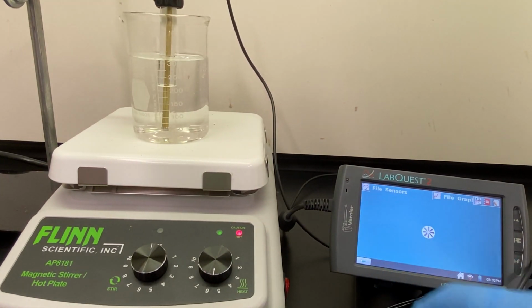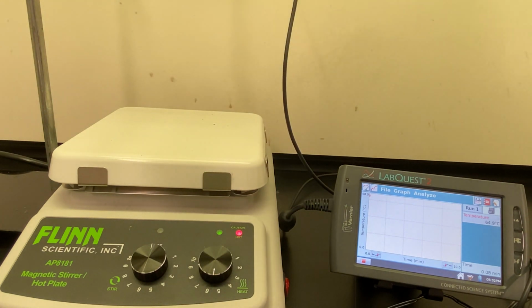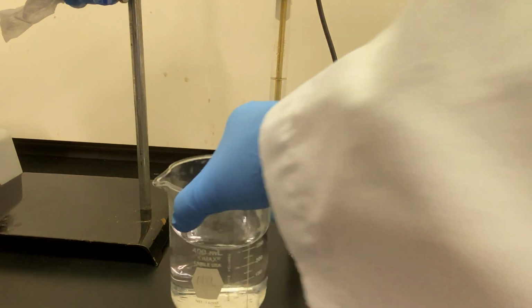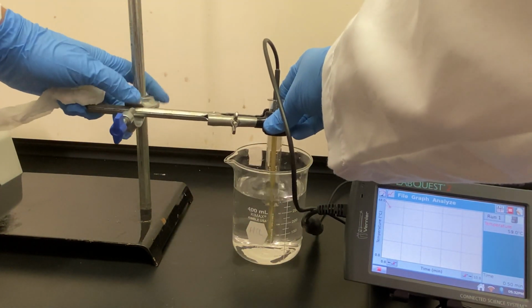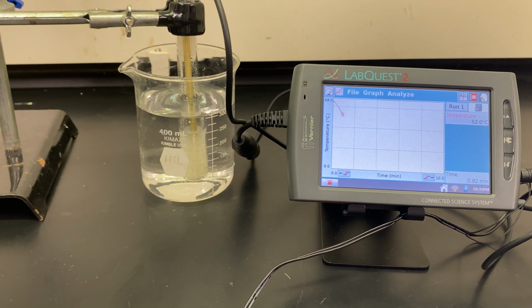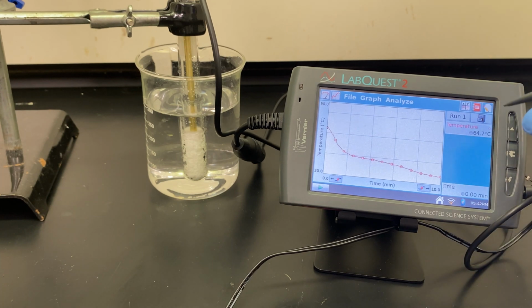Once the lauric acid has completely melted, press play on the LabQuest app, then remove the test tube from the heated water and place the test tube in a container of room temperature tap water. Continue to collect the data for the next 10 minutes. Once the run has completed, store the data by clicking the File cabinet in the top right corner.